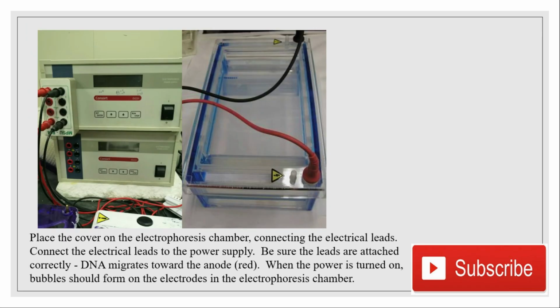So here in this picture you can see the electrophoresis chamber connected with the electric leads. Connect the electric lead to the power supply. Be sure the leads are attached correctly. DNA migrates toward the anode, from the black to the red side. When the power is turned on, bubbles should form on the electrodes in the electrophoresis chamber. It means that the chamber is working properly and the tank is receiving electricity properly. When this happens, you can say that the DNA will move from the negative to the positive side.